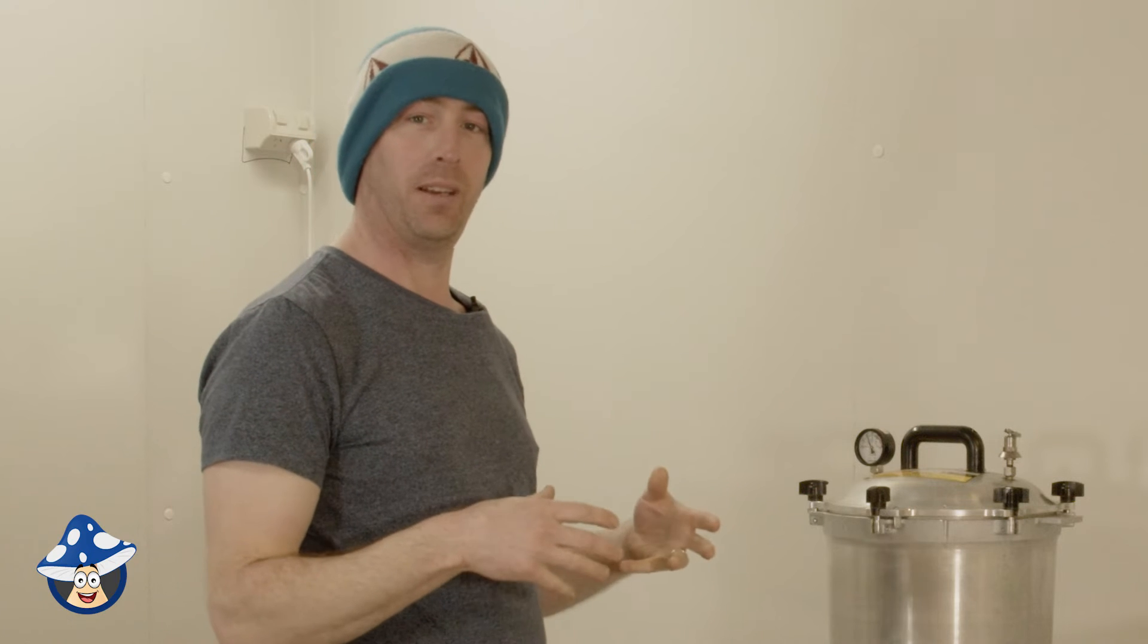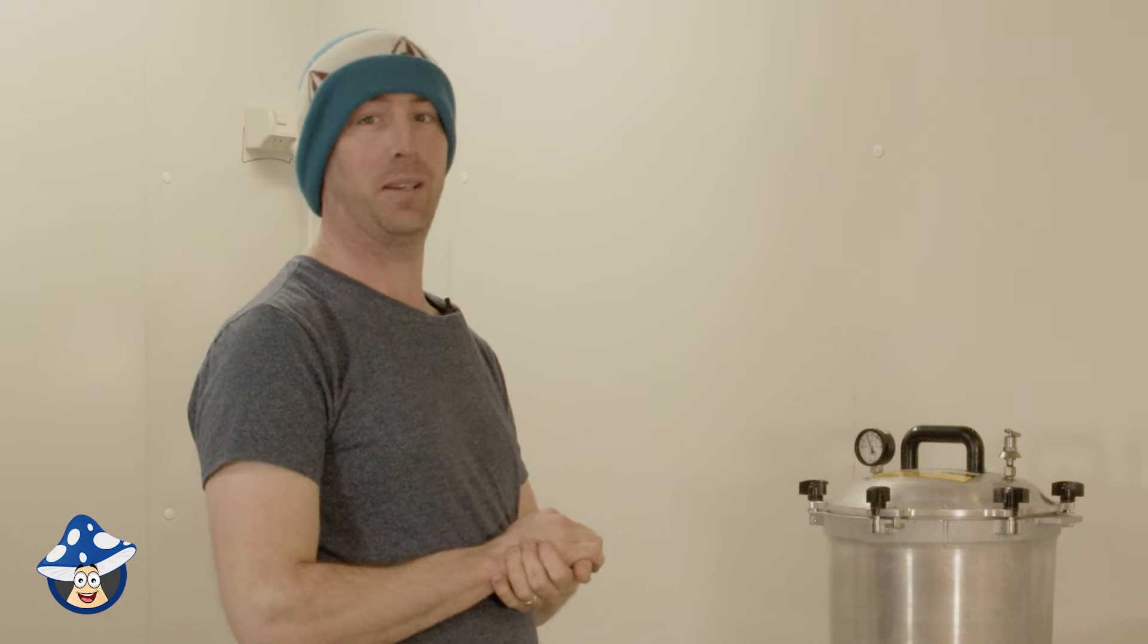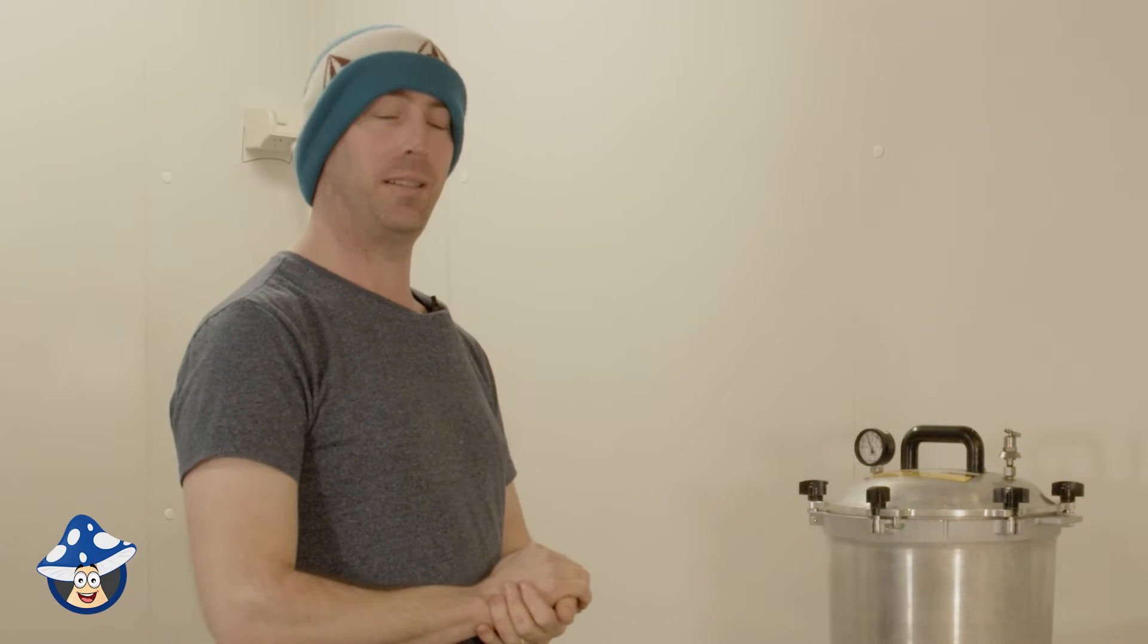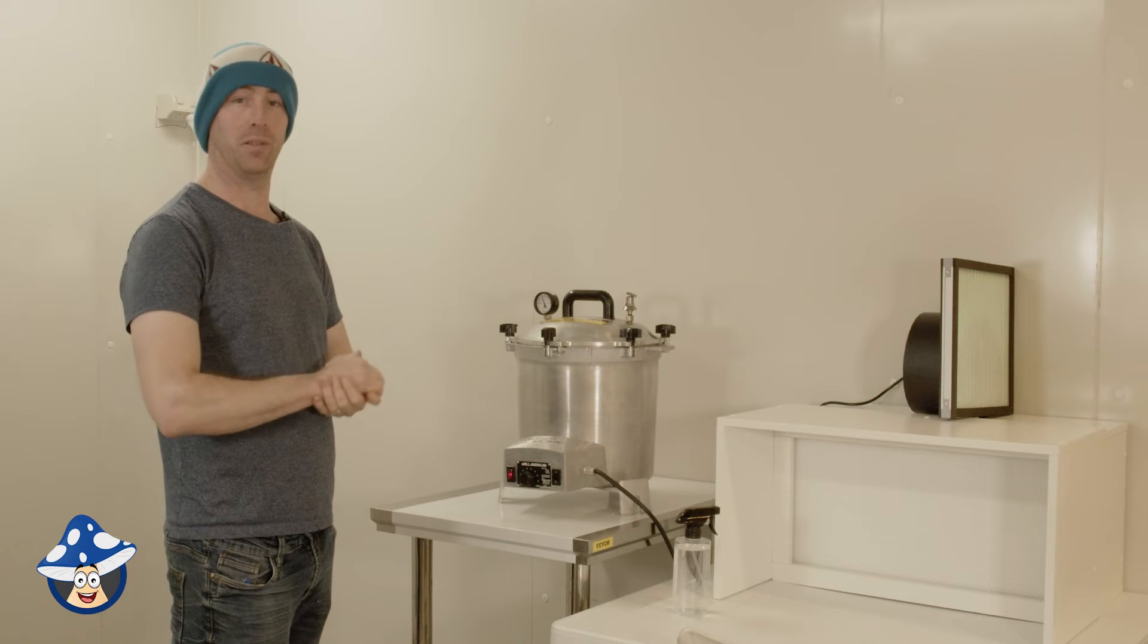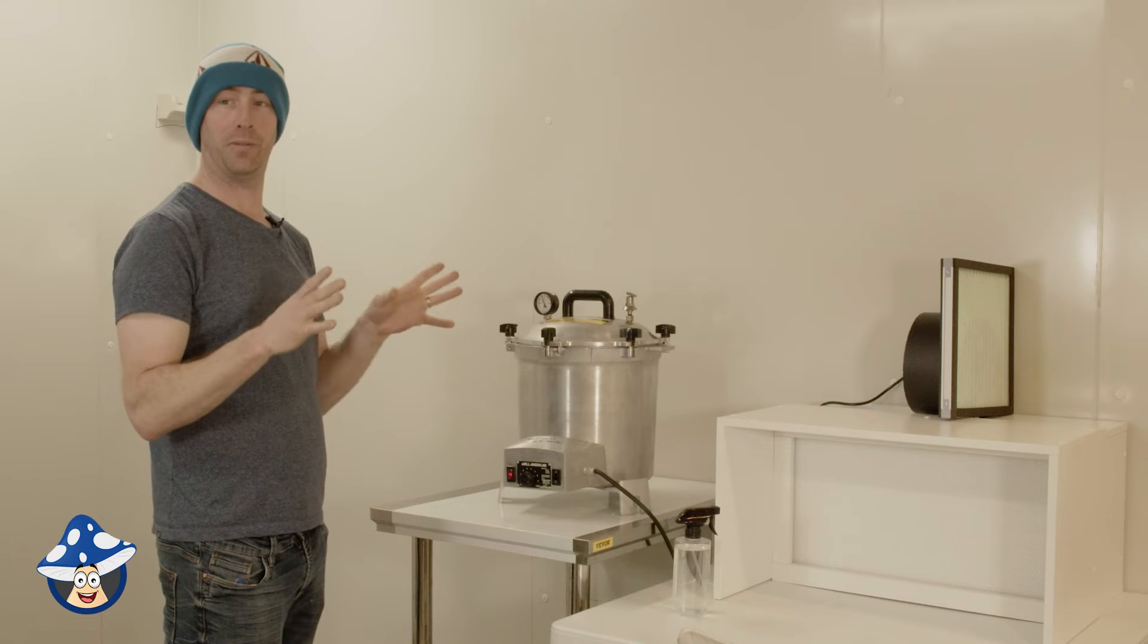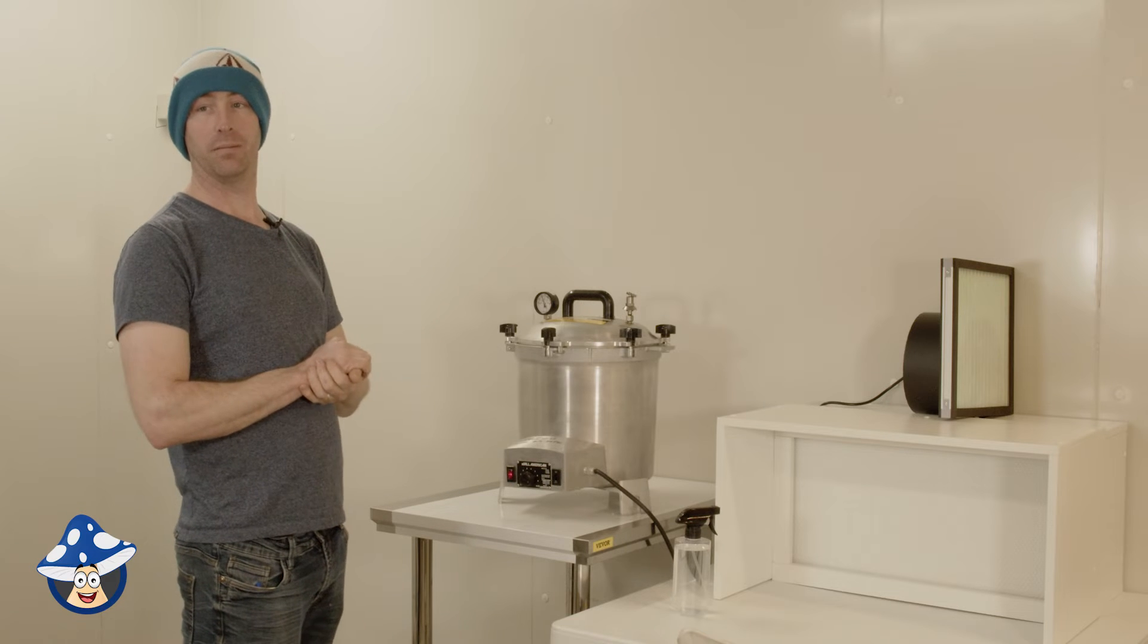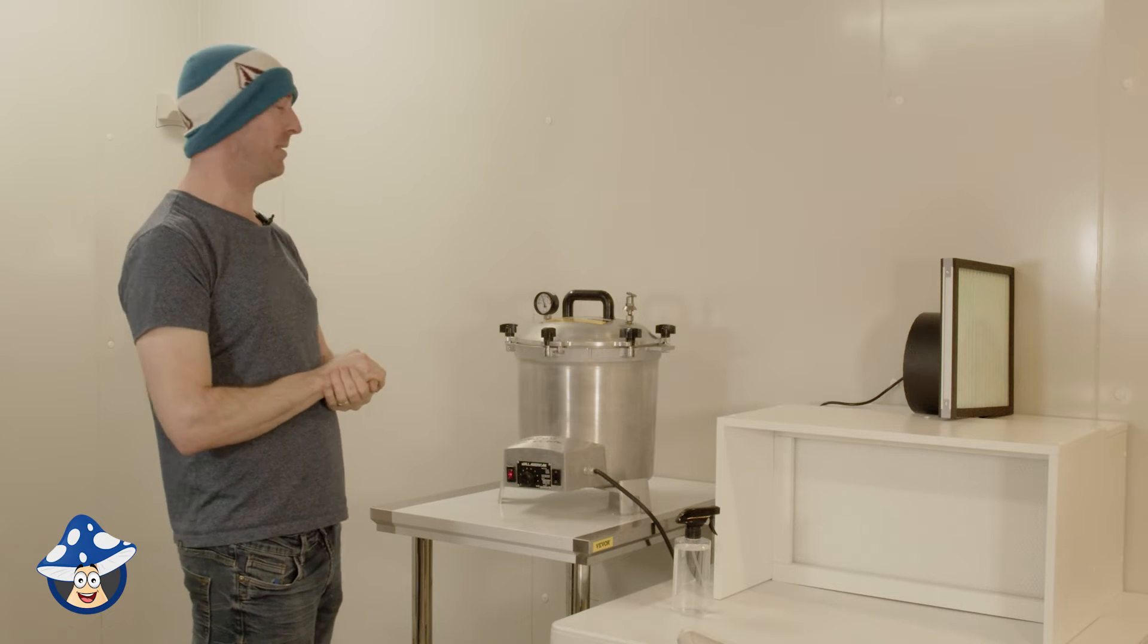Now see, to get to a high temperature, it needs to be under pressure. So that's why you have to pressure cook and that's why your oven doesn't work. All the time people go, can I cook it in my oven at 150 degrees? And let's get it be fire. It needs the pressure, so the steam pushes the heat into the grains or material. So you want to get things over 121 degrees for a minimum of 15 minutes to destroy any bad bacteria, anything, mold spores, bacteria spores. And then kill that bacteria.